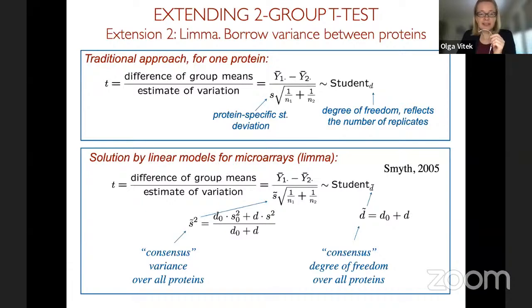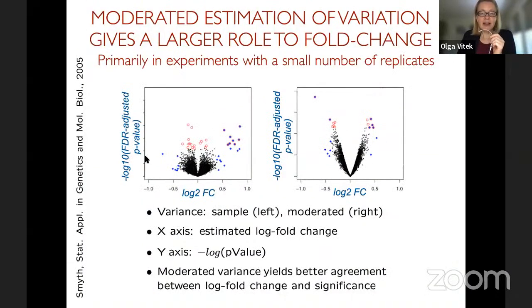So it's not as relevant. This is one of the older publications which shows essentially how the variance is stabilized. So this is the volcano plot as we discussed, right? Like log fold change and p-value negative adjusted for multiple testing.